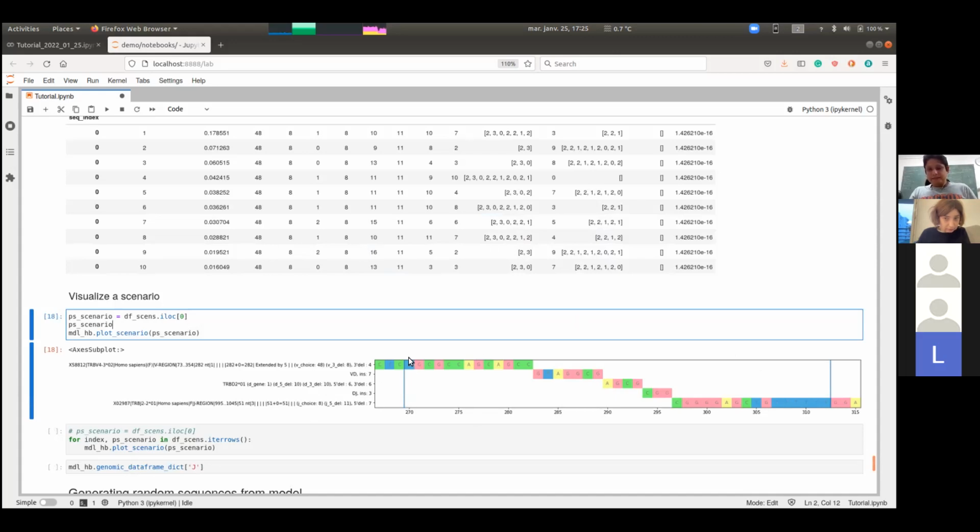These blue lines mark the position of the anchors. The anchors of the germlines are the conserved cysteine for the V gene, and the conserved phenylalanine and tryptophan for the J gene allele.